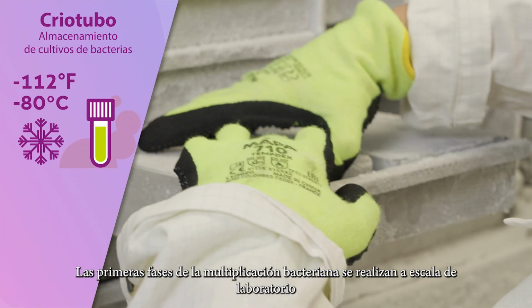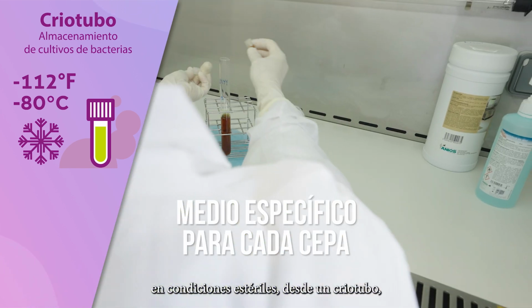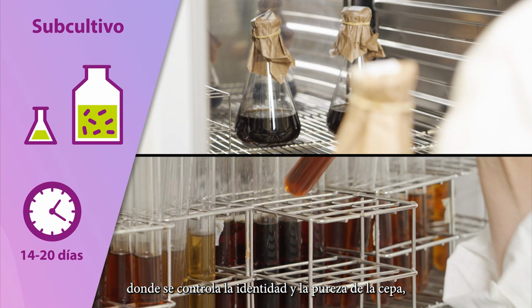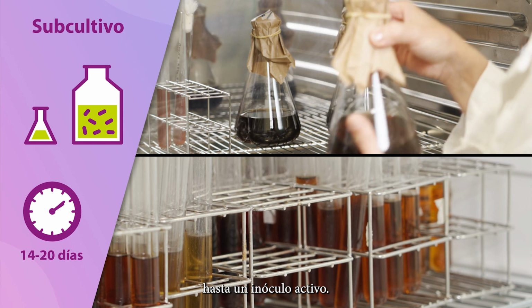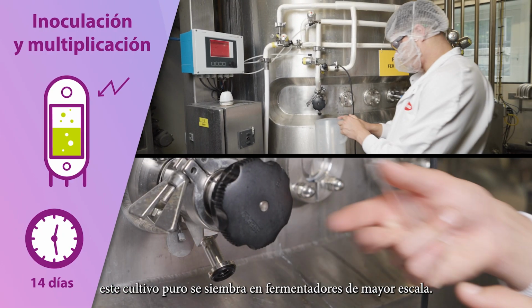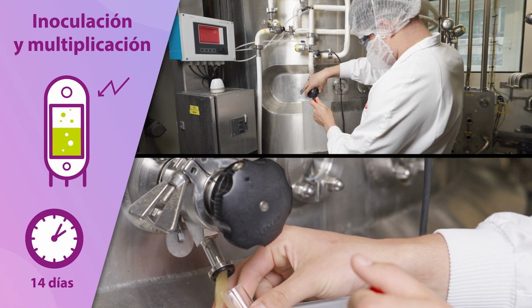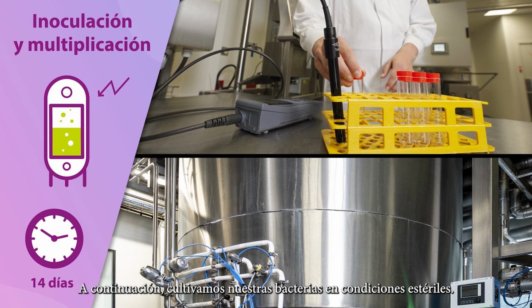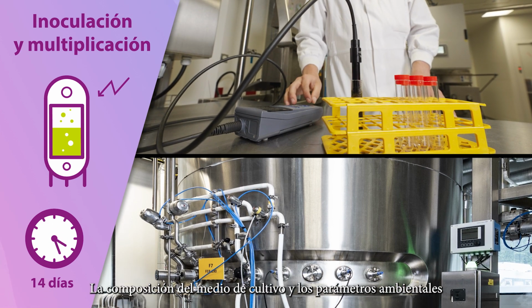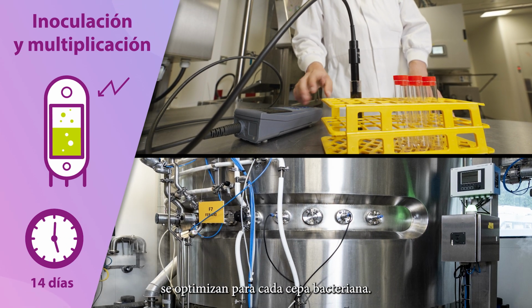The first stages of bacterial multiplication are done at lab scale in sterile conditions from a cryotube, where the identity and the purity of the strain is controlled, to an active inoculum. After ensuring the absence of contamination, this pure culture is seeded in large-scale fermenters. We continue to grow our bacteria under sterile conditions. The composition of the culture medium and the environmental parameters are optimized for each bacteria strain.